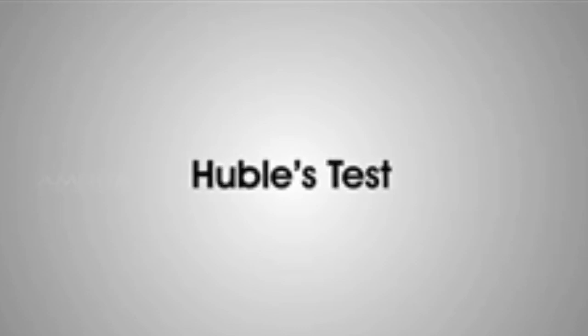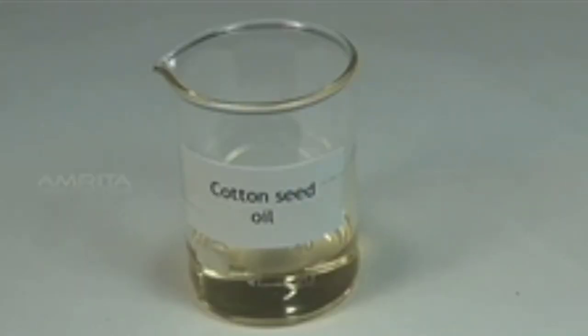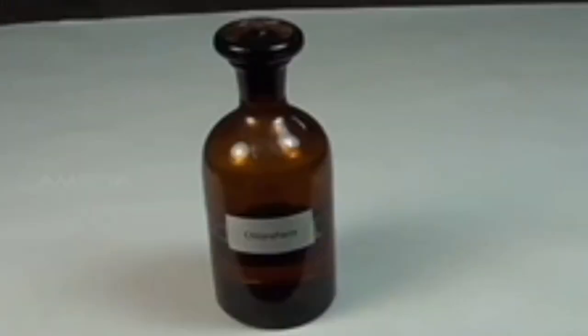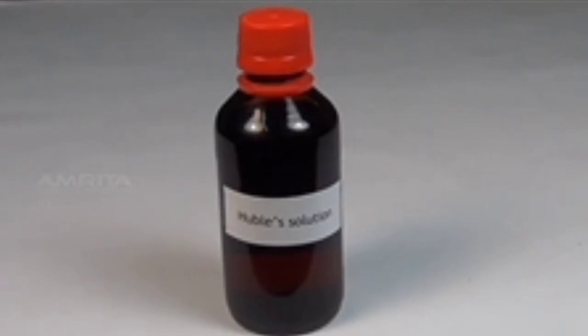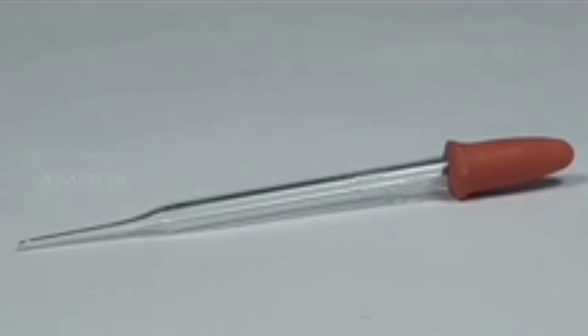Hubl's test. Materials required: cottonseed oil, linseed oil, chloroform, Hubl's reagent, test tubes and droppers.